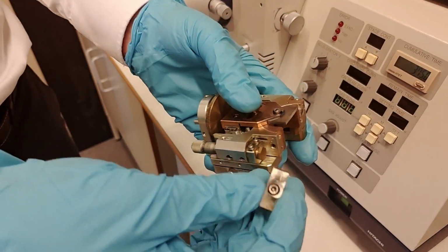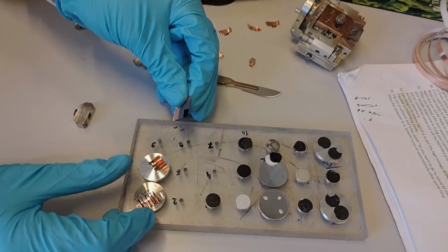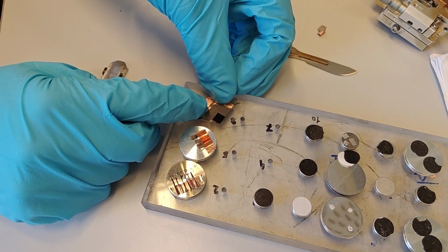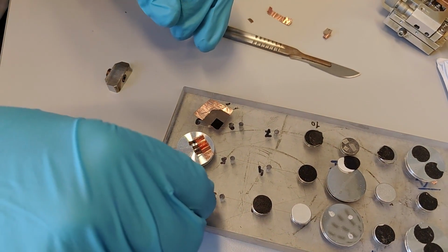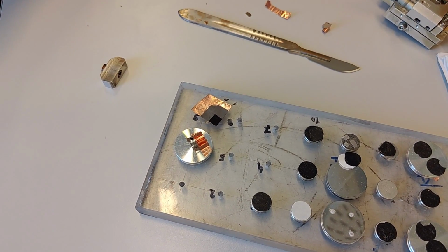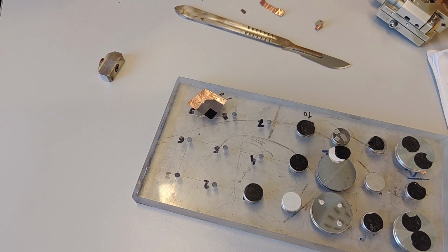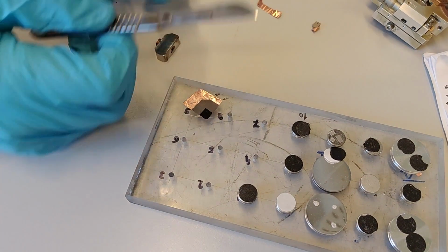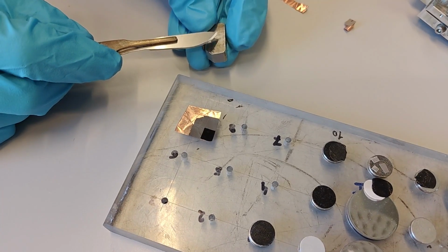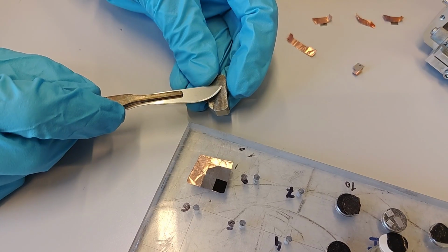Alright, so we take both, we can bring both of these over to our lab bench. And this was your sample, right? So let's practice on your sample directly. See if it works. Can you remove these other ones? So we want to cut out a slice. The width can of course be the full width of this, but the cut will only be 4 millimeter.